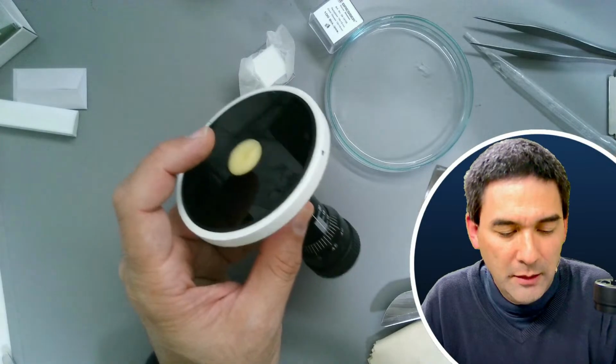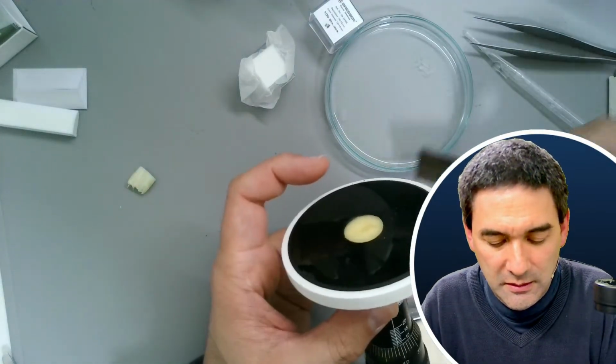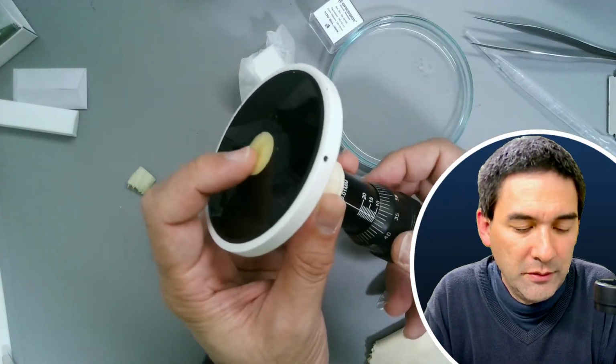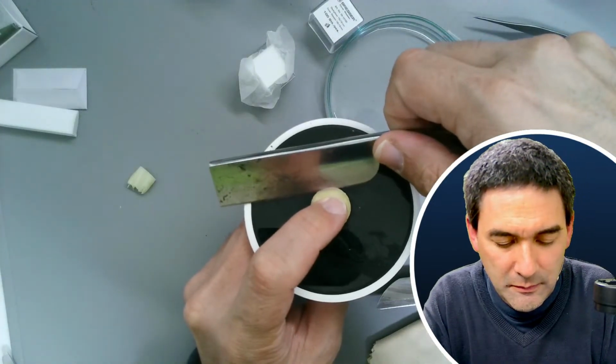Okay, now it's flush. So let's try it again. Let's rotate this a little bit out, and let's try it again.